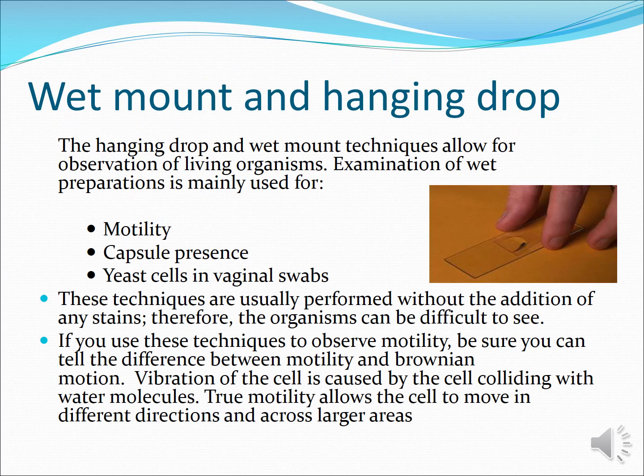First is the wet mount and hanging drop technique. The hanging drop and wet mount techniques allow for the observation of living organisms. Examination of wet mount preparation is mainly used for detection of motility, capsule presence, and vaginal yeast cells. These techniques are usually performed without the addition of any stains, therefore these organisms can be difficult to see.